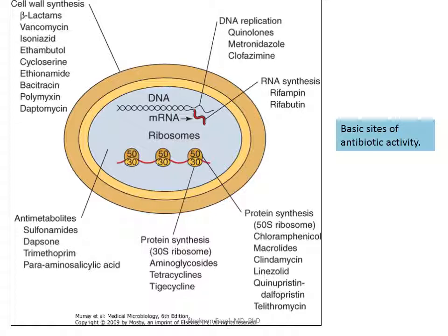Where is the protein element? Where is the carb element? And where is the periplasmic space? And what are these beta-lactamases? So get used to these things, because this is going to be very important. And today's lab will also give you a little bit of insight into the genetics as well. We'll have a genetics lab coming up as well.